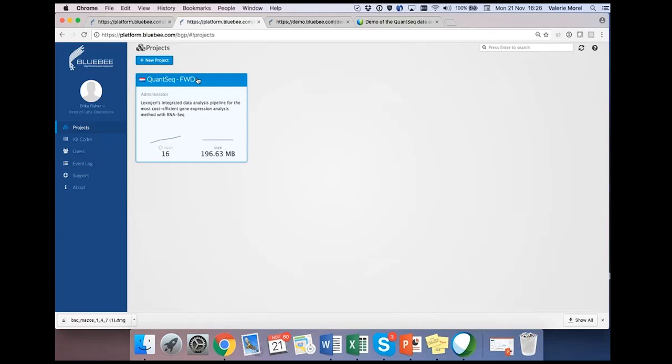It's complicated, but we tried it with QuantSeq reverse with TopHat 2, and it just crashed. And Cufflinks you don't need at all, since with Cufflinks you compute the FPKM values for your transcripts and then go back to gene level, and that's not necessary because you cannot distinguish the end sites so well that you see the transcript abundances in a way to get a proper gene count.